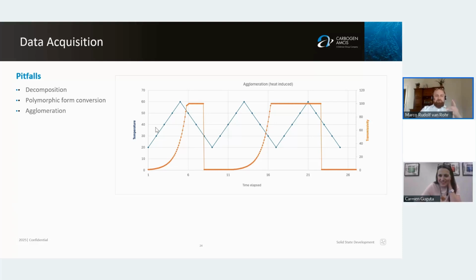Sometimes what we also do when we make a centrifugation, and we see a couple of solvents which show low solubility, we check in a microscope how the particles look, whether they changed a little bit. That's a good one, and we can get good morphological information. So stuff like that. It's from different sources.